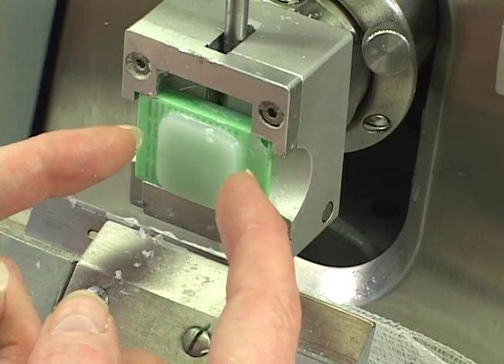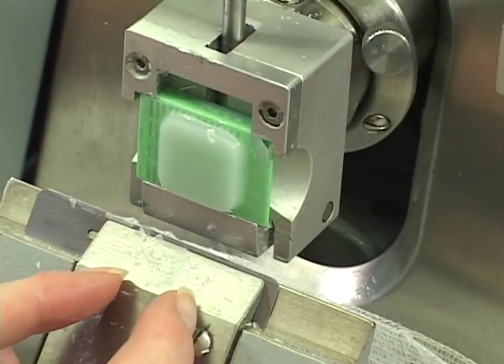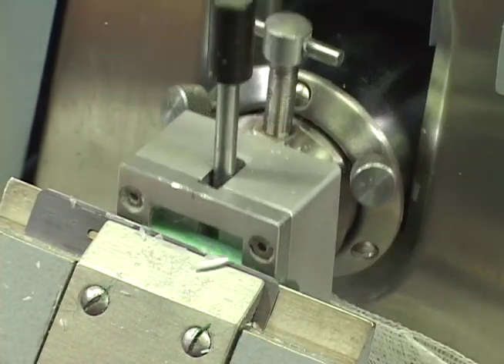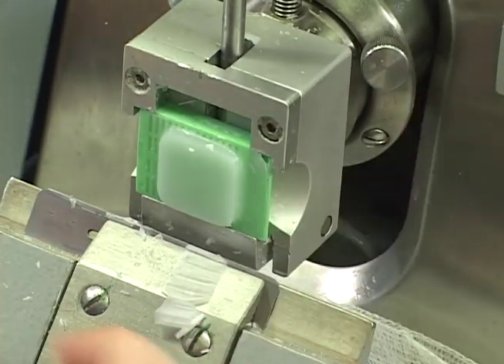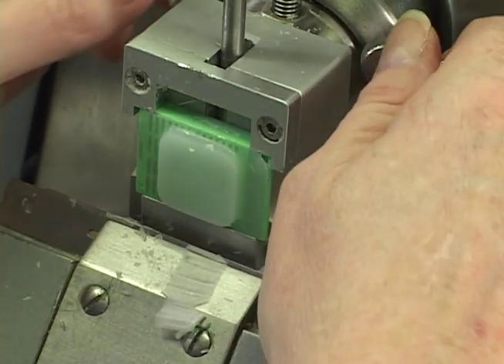and I took the block out, so now it's a little bit different, and now it's wanting to cut more on the right side than it is on the left for some reason. Now you can leave it like that if it's not that big of a difference, but if it is and you have precious tissue, you might make that slight adjustment to change it.